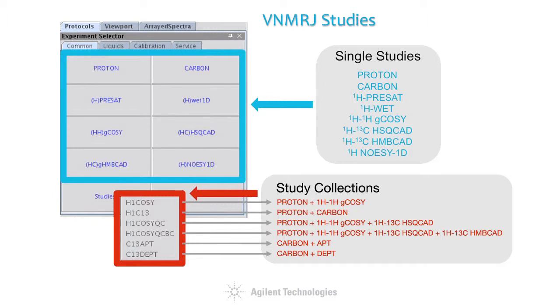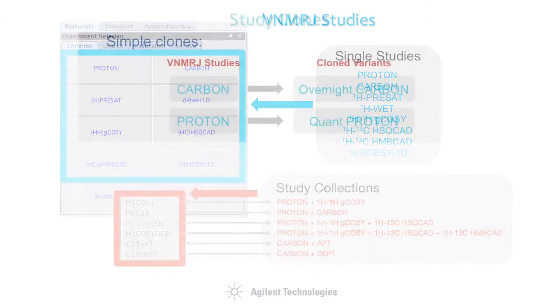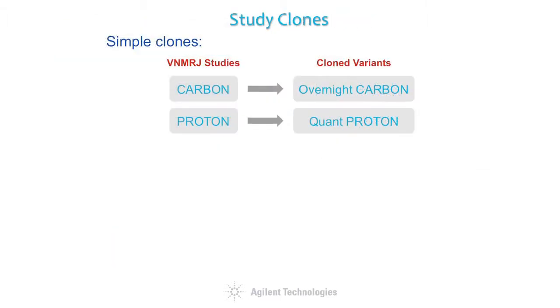Study collections may prove extremely handy when the same experiment combination must be repeated on many samples over and over again. One of the primary tools a spectroscopist can use to customize the interface is known as a study clone.